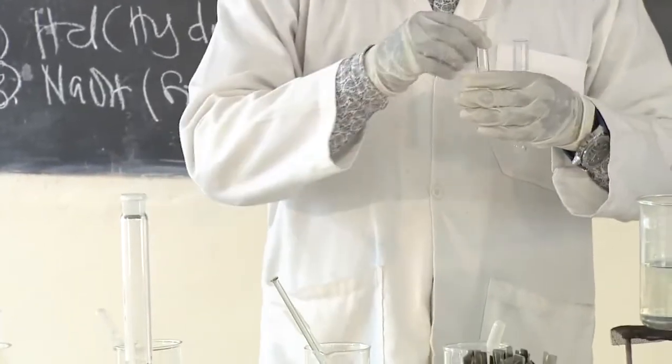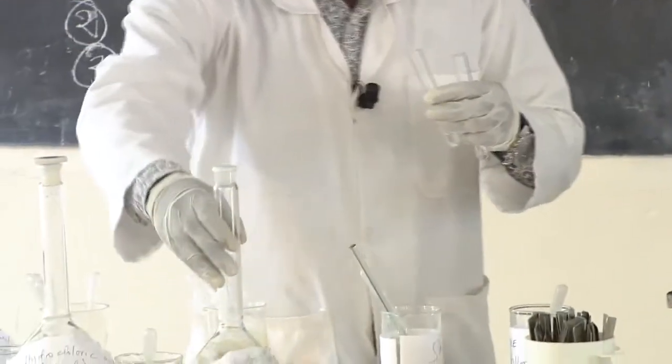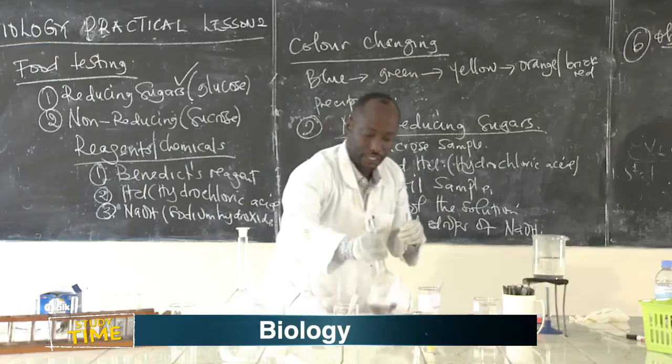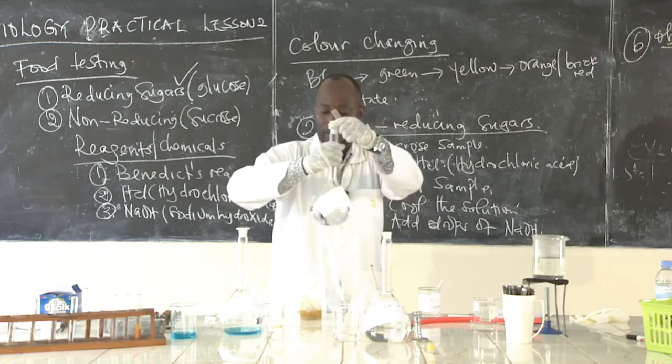After adding the sample, I add hydrochloric acid. This is sodium hydroxide. This is hydrochloric acid.